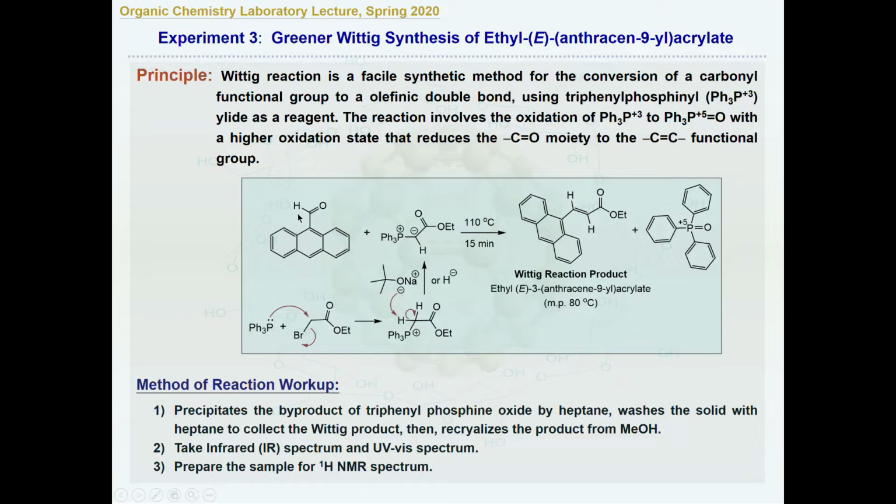So the infrared is very crucial for the functional group change, but UV visible is very crucial for the conjugation, and that's the reason. If you see one peak around 300 and another at 380, and both exist, it's quantifiable, the ratio between starting material and the product. So you can use the extinction coefficient and the peak heights to exactly calculate the ratio between them and know what product conversion you have.